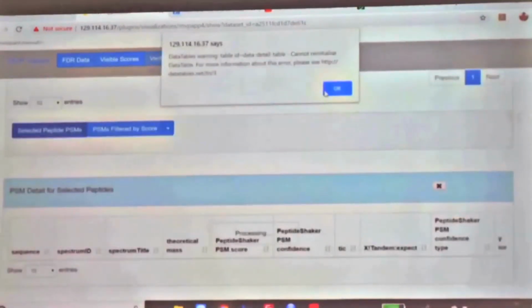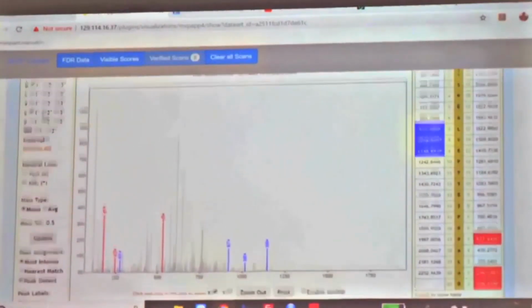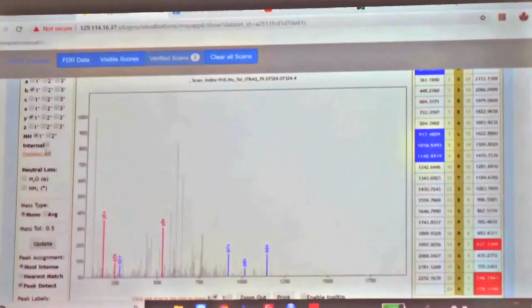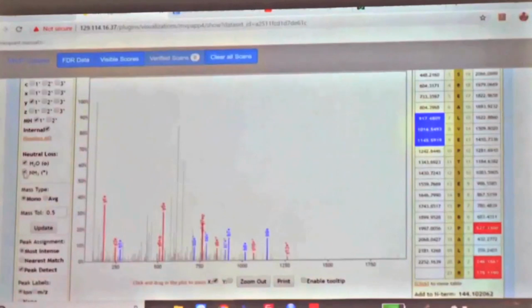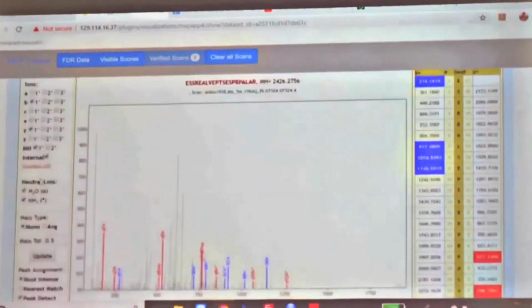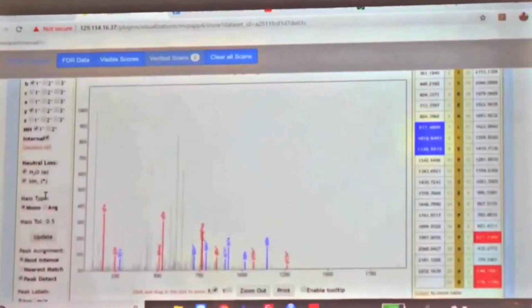it opens this, and it gives you this peptide here, and now I can select whatever internal ions. It's not been annotated right now. If I start doing this, you might agree with it, but it's a very subjective thing. I might think 3 continuous ions is good, but you might not, and at least it gives you the ability to look into that. It helps you to do that, and you can also do it for other spectra and so on and so forth.